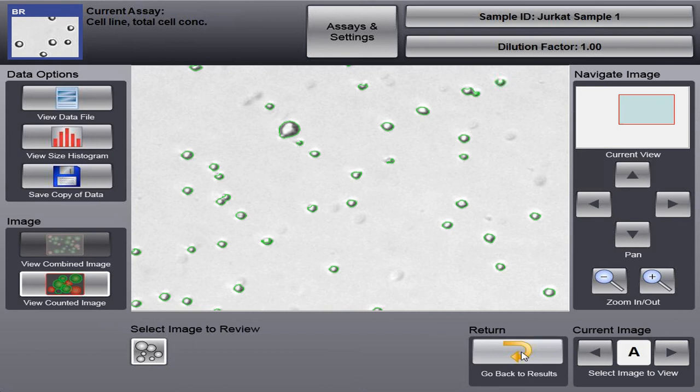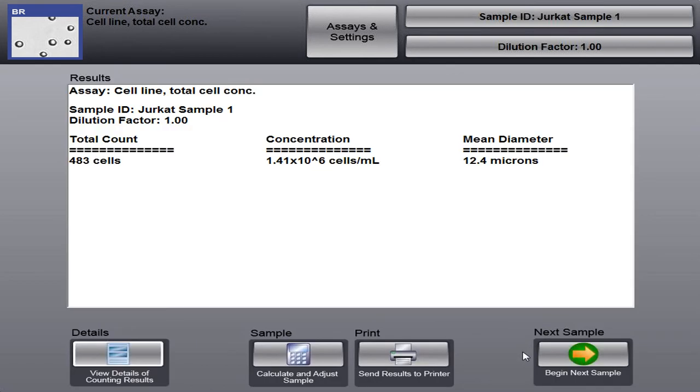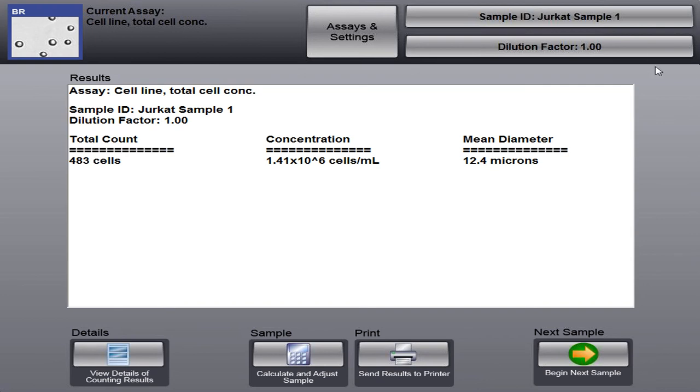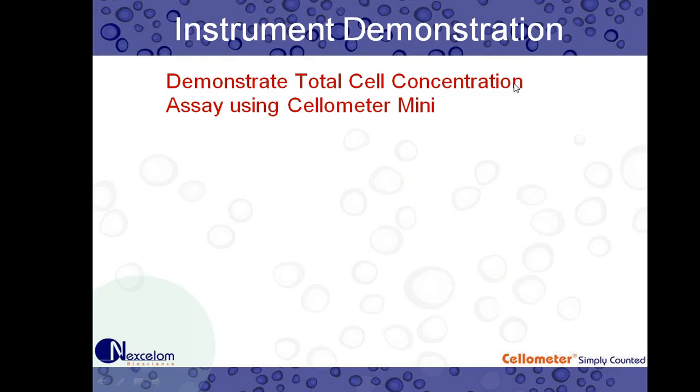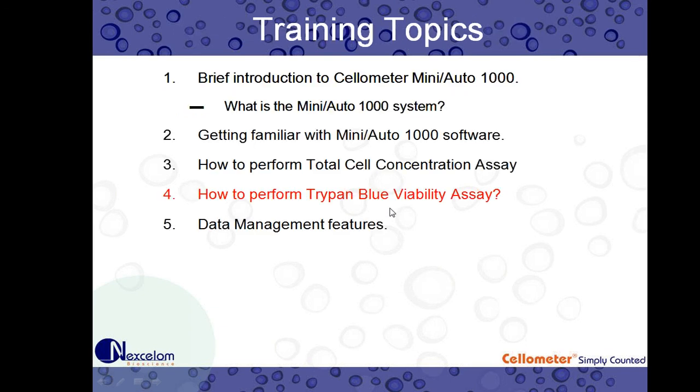So I'm going to go back to our results. And you see over here in the bottom right, next sample. This is when, once we've finished our count, we have our data recorded. We can begin our next sample. So I'm going to switch back to our PowerPoint.